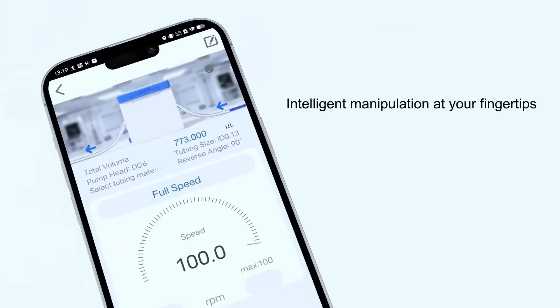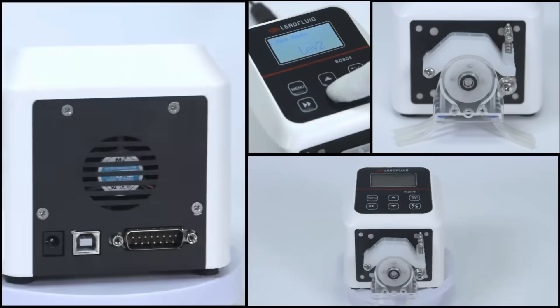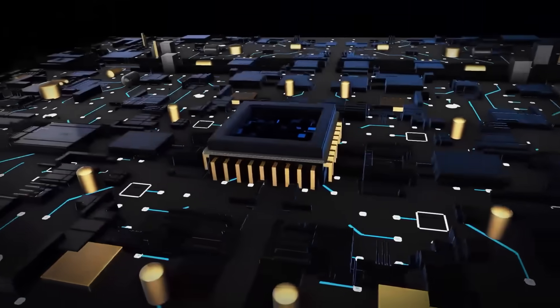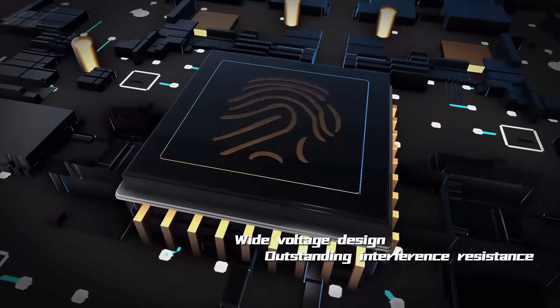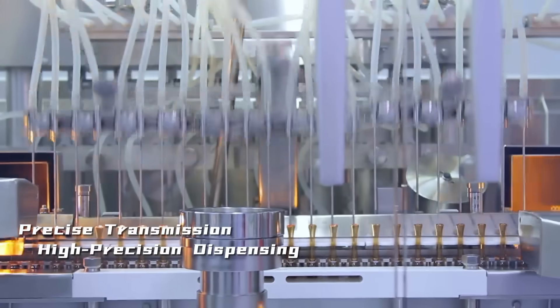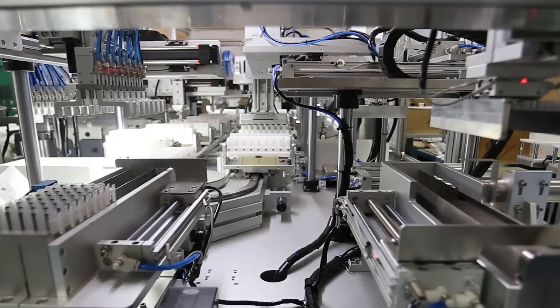Lead Fluid BQ80 strives for excellence in every detail. The circuit board employs a special protective process, offering dust and moisture resistance. Its wide-voltage design ensures outstanding interference resistance. The BQ80 is suitable for the precise transfer and high-precision dispensing of small liquid flows, making it ideal for instrument matching and laboratory use.